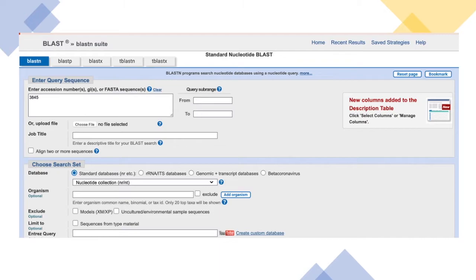The Coolest Blast Parser, as I've been mentioning throughout this video, really allows you to take out some of the complexity of this thing and get down to the bare bones of what it is that we're trying to accomplish. What the BLAST parser does is it allows you to create your own database that you want to run your queries against, and then query the database in an automatic fashion. Simply just type in your command and hit run.